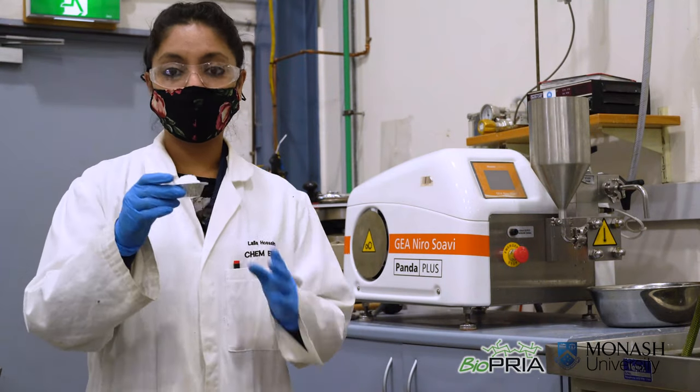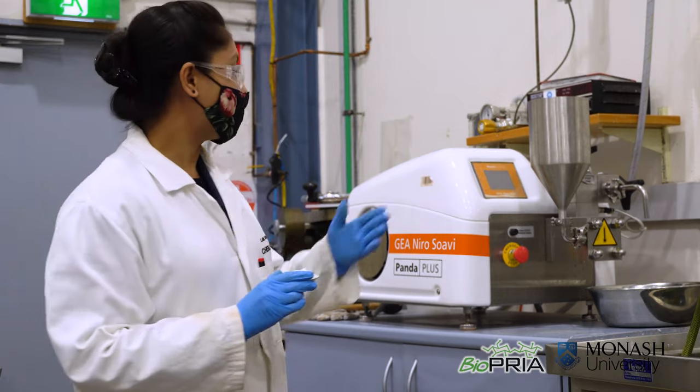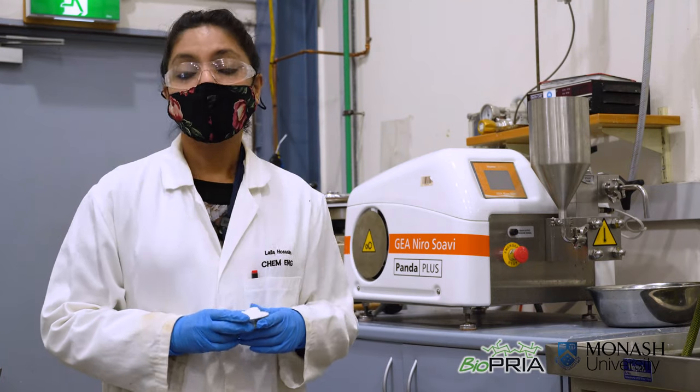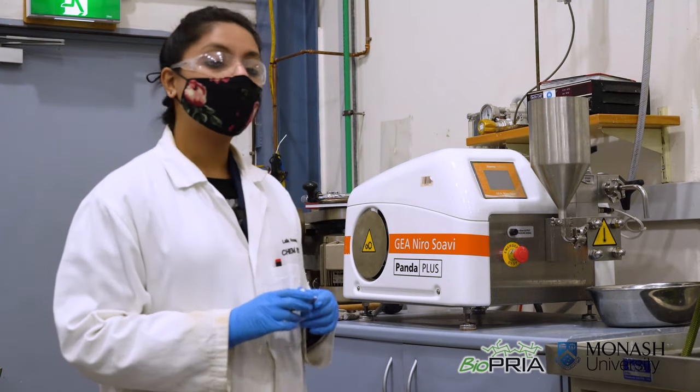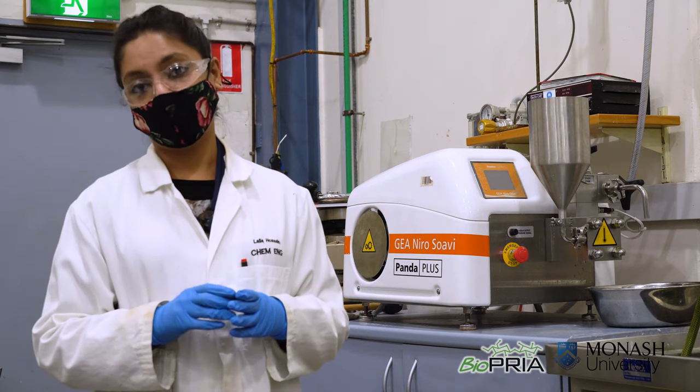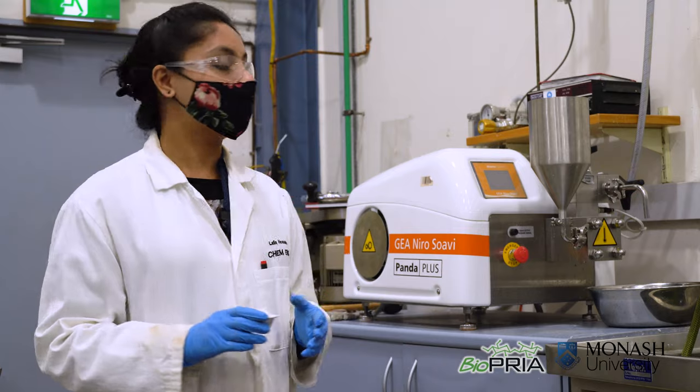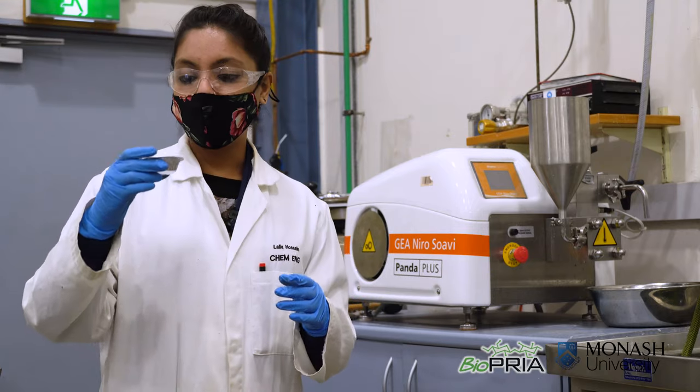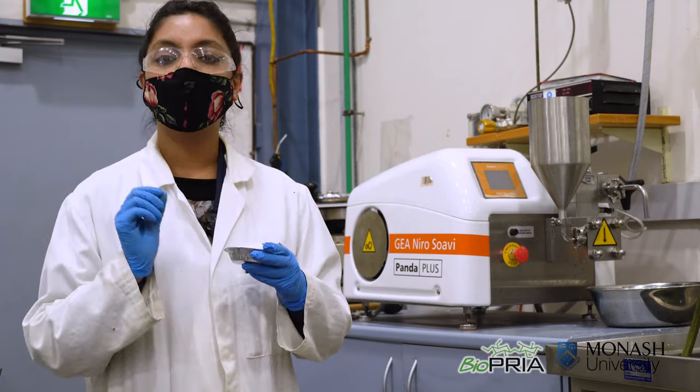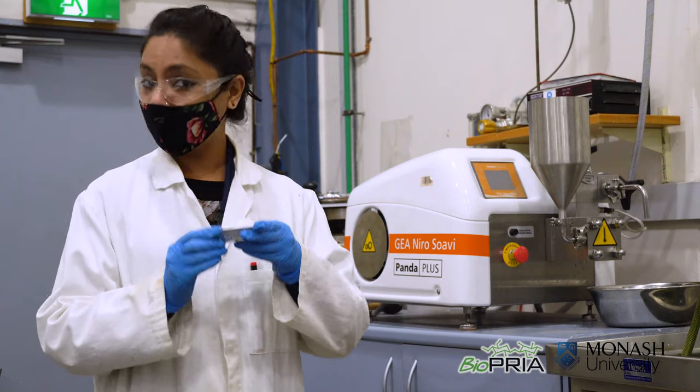Now that we have the oxidized fiber we are ready to do homogenization at 1000 bar. Typically homogenizers are used to prepare emulsion including your favorite ice cream. However in this activity we are going to use homogenizer to fibrillate this cellulose pulp into nano size smaller cellulose fibers.